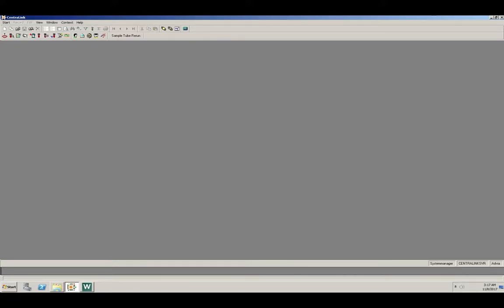My name is Taylor, and today I'm going to introduce you to Centralink and teach you how to use some of its functions. So what is Centralink? Centralink is a middleware that serves two basic purposes.